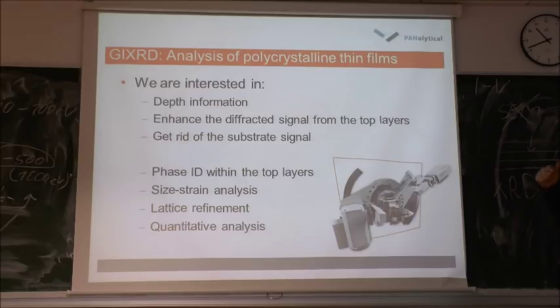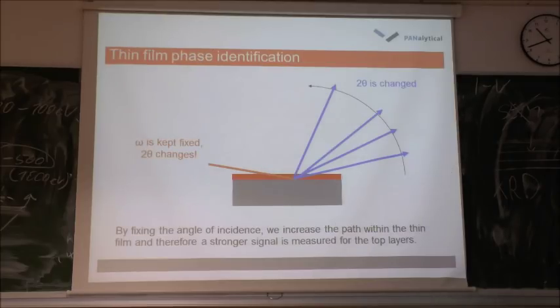In this way we enhance the diffracted signal from the top layers, and we decrease the intensity of the substrate. So again, very similar to Bragg-Brentano: phase ID, size strain, lattice refinement, and quantitative analysis. So this is the geometry.